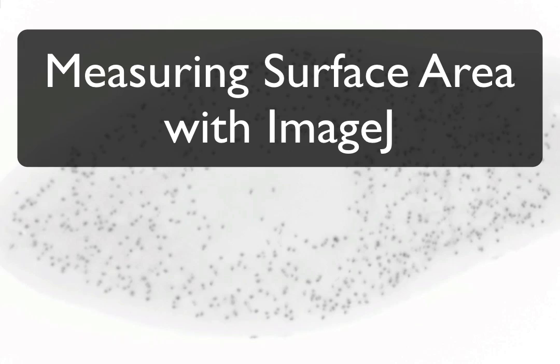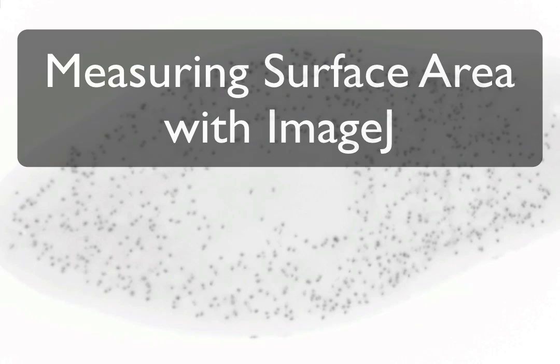Hi there Keen State Biology Crew. We're going to use ImageJ one more time. This time we're going to find the area of a particular slide.